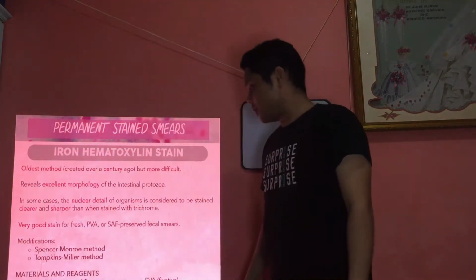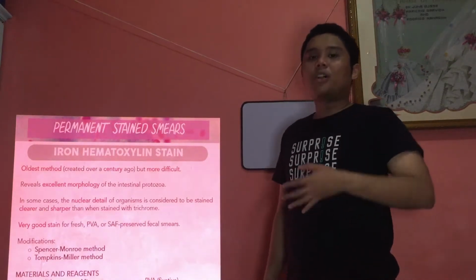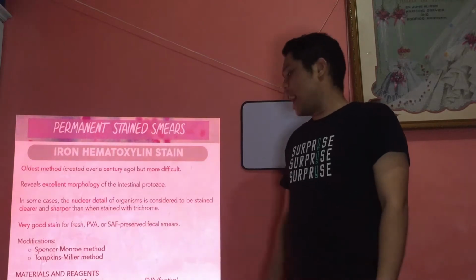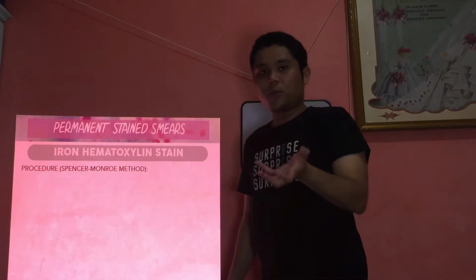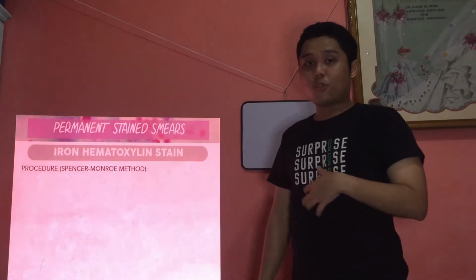Now for our materials, as you can see, very straightforward. We need the slides, your sample, your applicator stick, the stain itself, iron hematoxylin, and a fixative, which is your PVA. Now we go into the procedure. The procedure that we will follow in our lab activity is the Spencer-Monroe method.